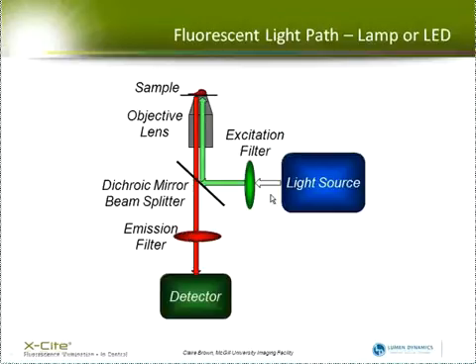So some of the white light from the light source or the green light from the excitation might get through to the detector. So the emission filter is also sometimes called a barrier filter. It selects the red light, but it also blocks any stray light that might get into the detector. And then you have a detector, which is a camera or photomultiplier tube, depending on your system.